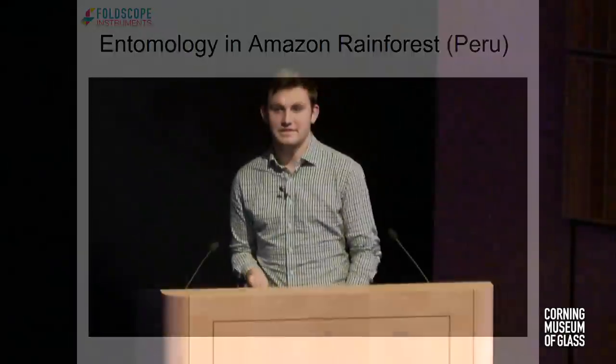So again, this demonstrates the ability to take something like this to the field and to discover new species, especially since Peru is a crazy spot for biodiversity. And so one more, and some of our users have made these really amazing videos. This is from a group called Project Shine that works in Tanzania on teaching sanitation there.